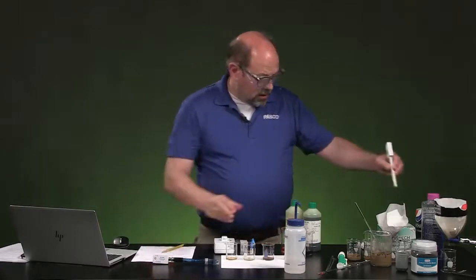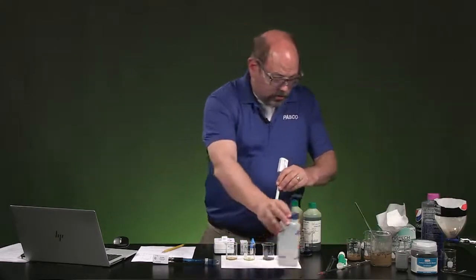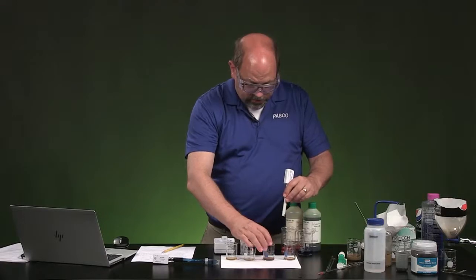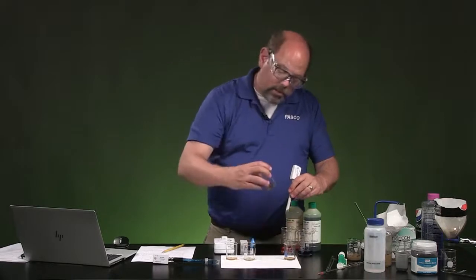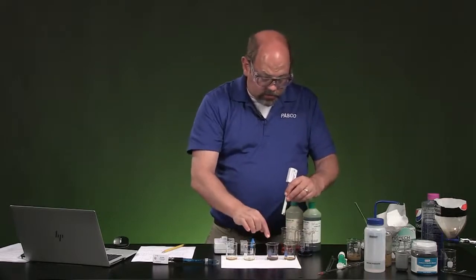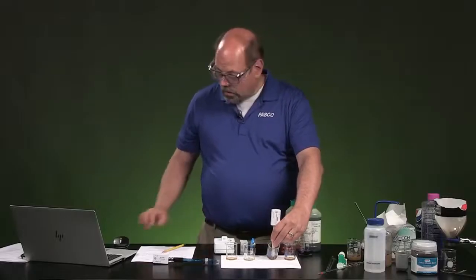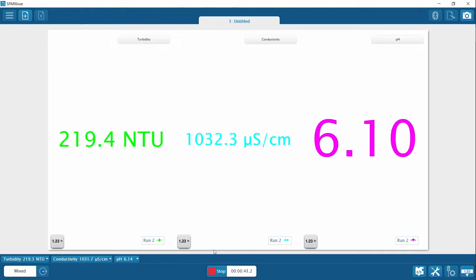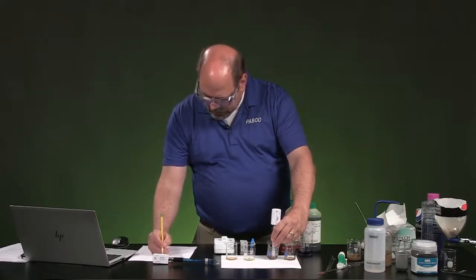Awesome. Again, I'm going to rinse it off. Now we're going to put it into the beaker that was filtered after it had settled, just through sedimentation, I believe. Is that right? Let me look at mine. Oh, this is through activated charcoal. So this was filtered through the paper with activated charcoal. All right. Oh, and I didn't hit stop, but I'm still writing these down, so that's fine. If anything, it's about the same, on a scale of 1,000. It's a little lower, not tons lower. So activated charcoal is 1,038.